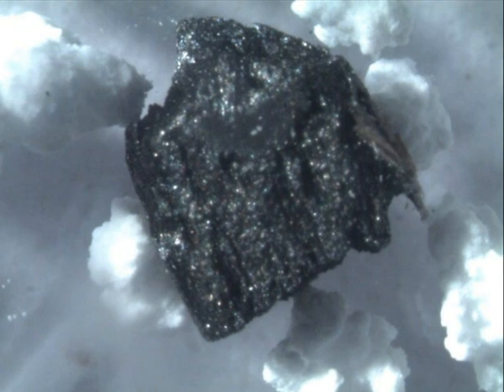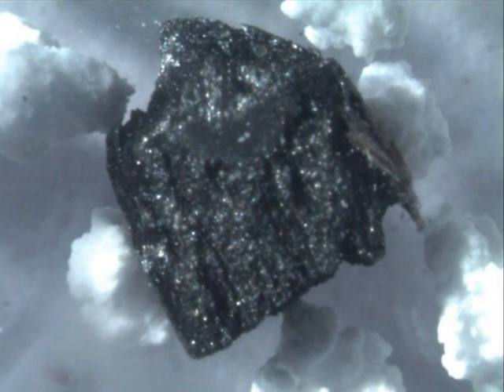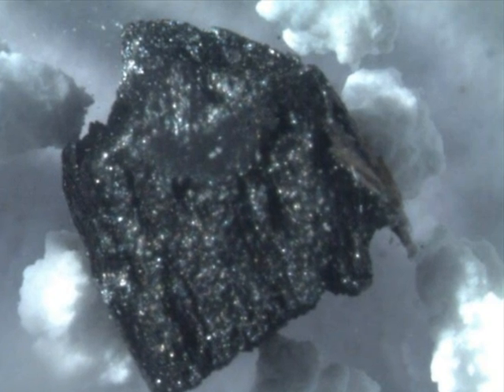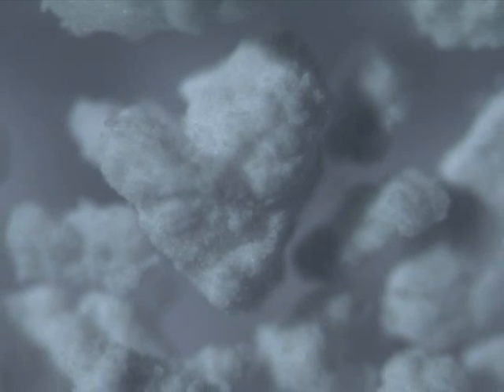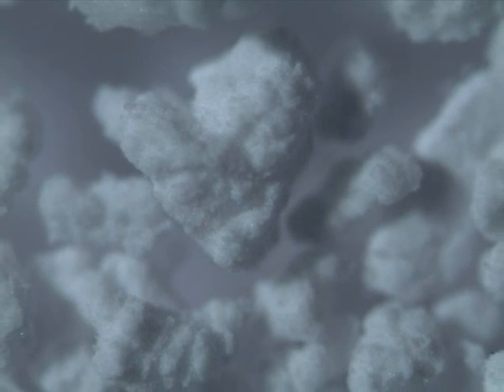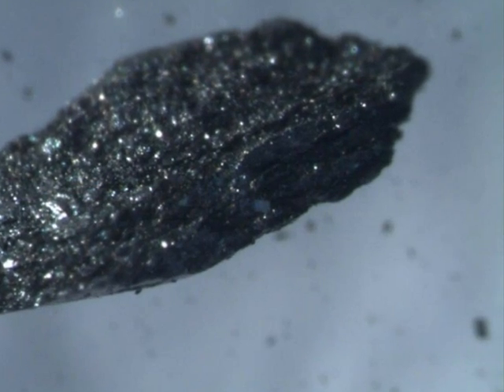Also in trace examination, unknown samples can be identified by observing the surface details. Here the unknown appears to have a white fluffy substance that surrounds a black crystalline object. The unknown can be compared to known samples to determine its identity. The unknown in this sample was identified to contain soap powder and graphite.